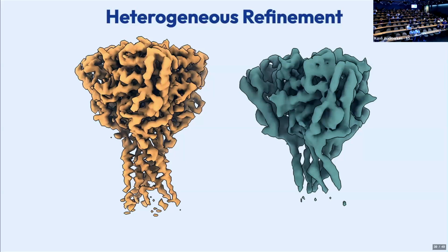And this is a fundamental question about clustering methods, and not even cryo-EM specific. Generally speaking, for any method that clusters data, clustering is fundamentally a difficult problem, and not guaranteed to give you the same solution every time you run it, being heavily dependent on initialization and other randomness that is part of these algorithms.